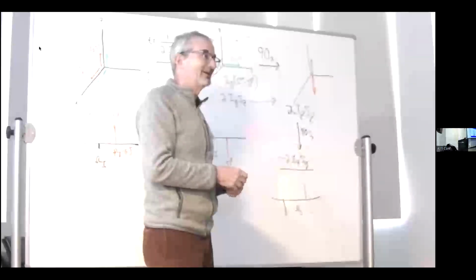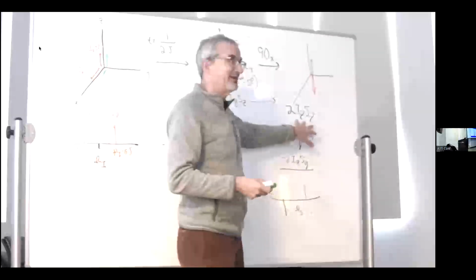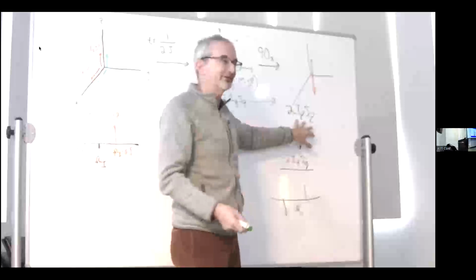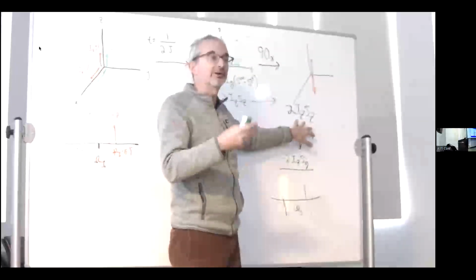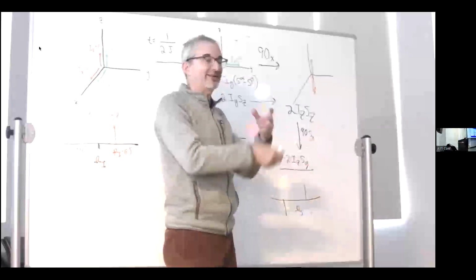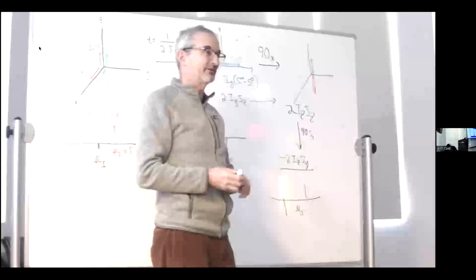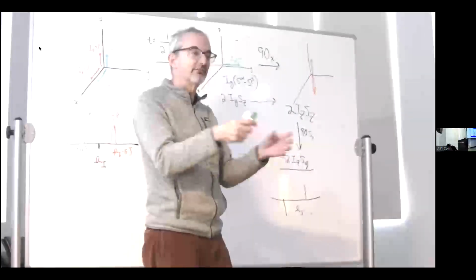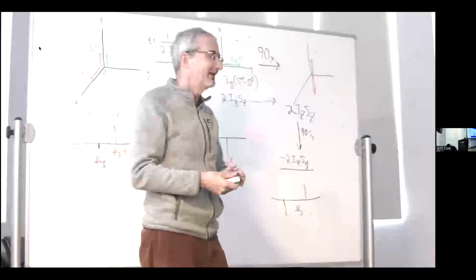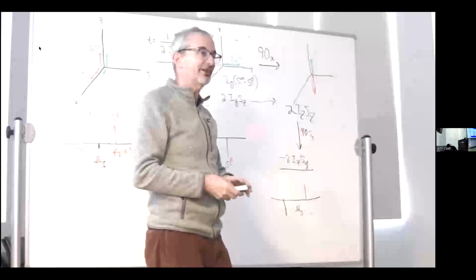In this particular case, it's easy for me to see the creation of the symmetric state. In other cases, particularly homonuclear experiments, that state is created during the pulse and then disappears. But conceptually, transfer of coherence from one coherence to the other almost invariably has to go through some kind of symmetric state.